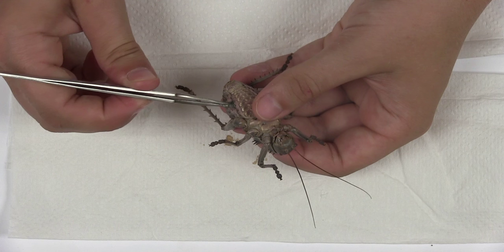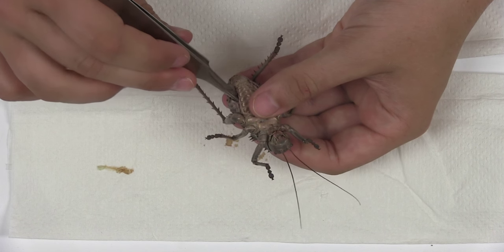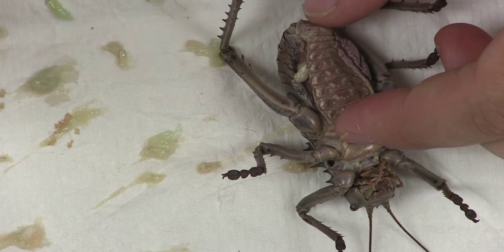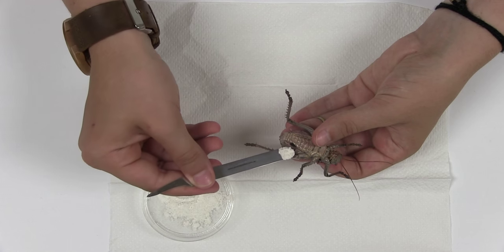Using your fine tipped forceps, remove the gut contents from the incision which you made. Continue removing the contents carefully in order to avoid damaging the insect until there is nothing left to remove.